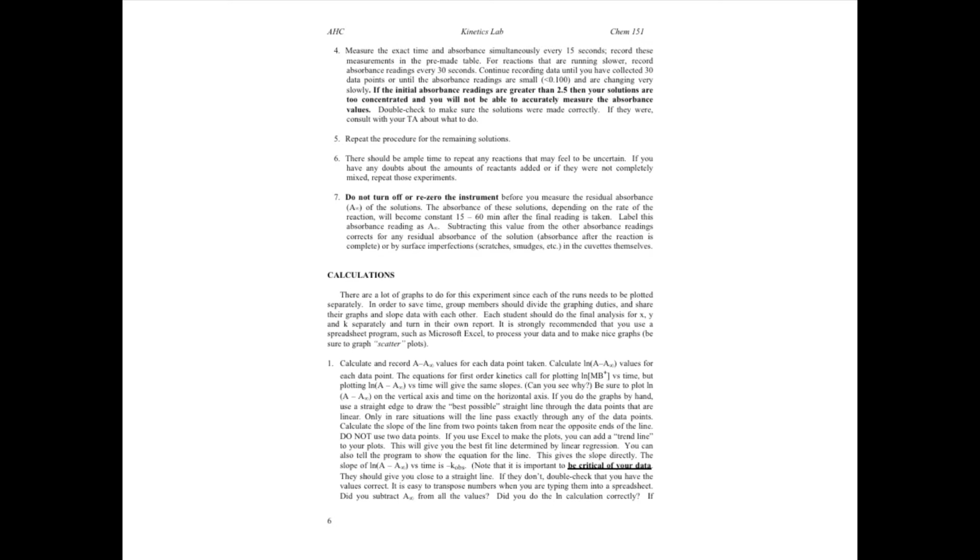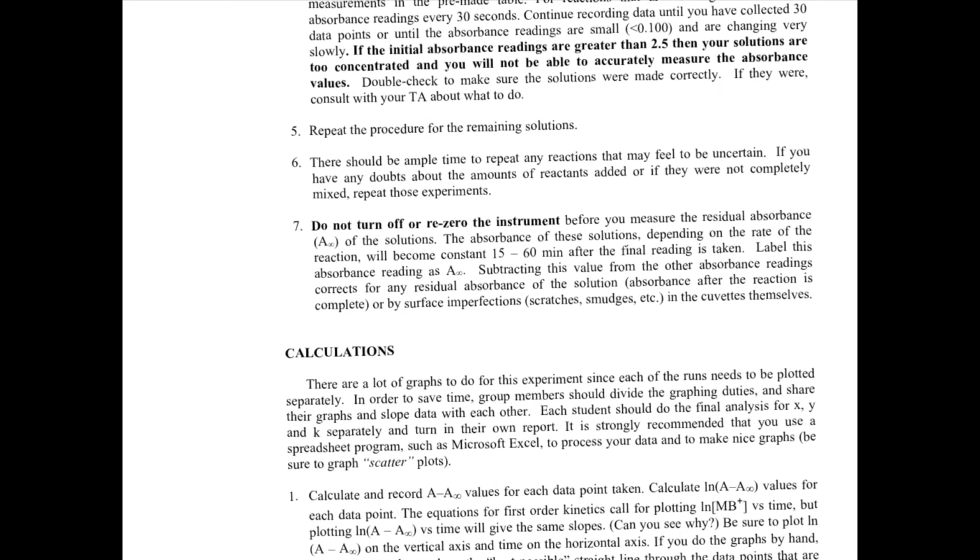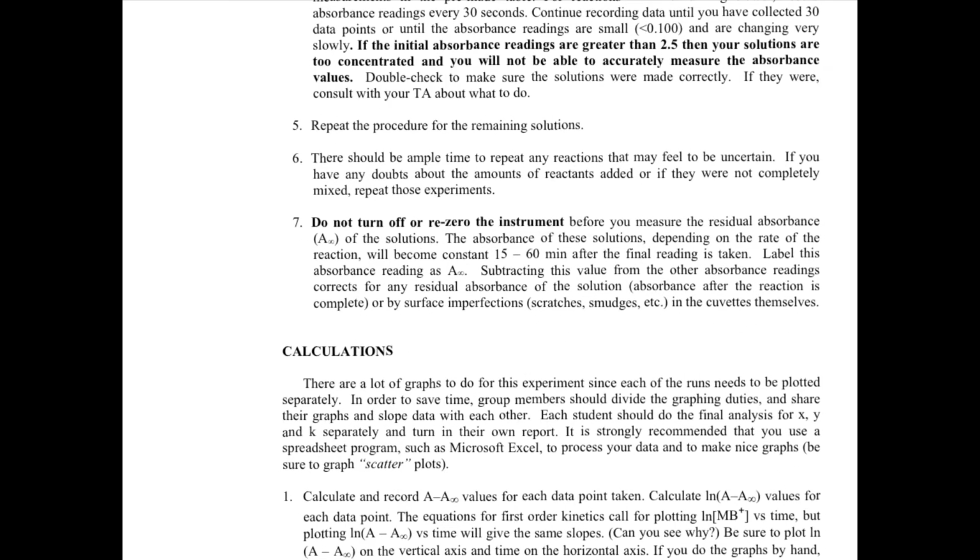All right. The other thing that we're going to be measuring is what's called A infinity. This is the background reading, the residual reading that's left over once the reaction is complete. We're going to end up subtracting that from the absorbance values that we write down in order to get a more accurate reading for the absorbances. All right, let's get started.